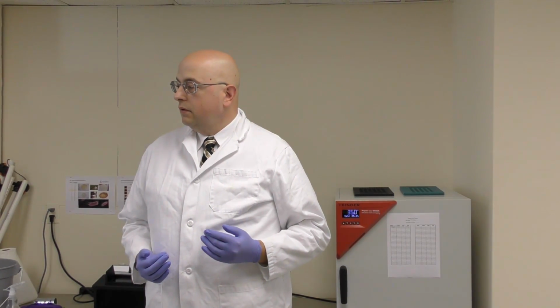The Rivanna Conservation Alliance is currently level 3 status by the Virginia Department of Environmental Quality for benthic macroinvertebrate monitoring. After today's training, I follow up with an audit to make sure that the procedures we're covering today are being followed. RCA could become level 3 status for E. coli bacteria using the Colilert procedure. That would make RCA the first citizen group that's level 3 status for benthic macroinvertebrates and E. coli bacteria, which is a unique distinction.